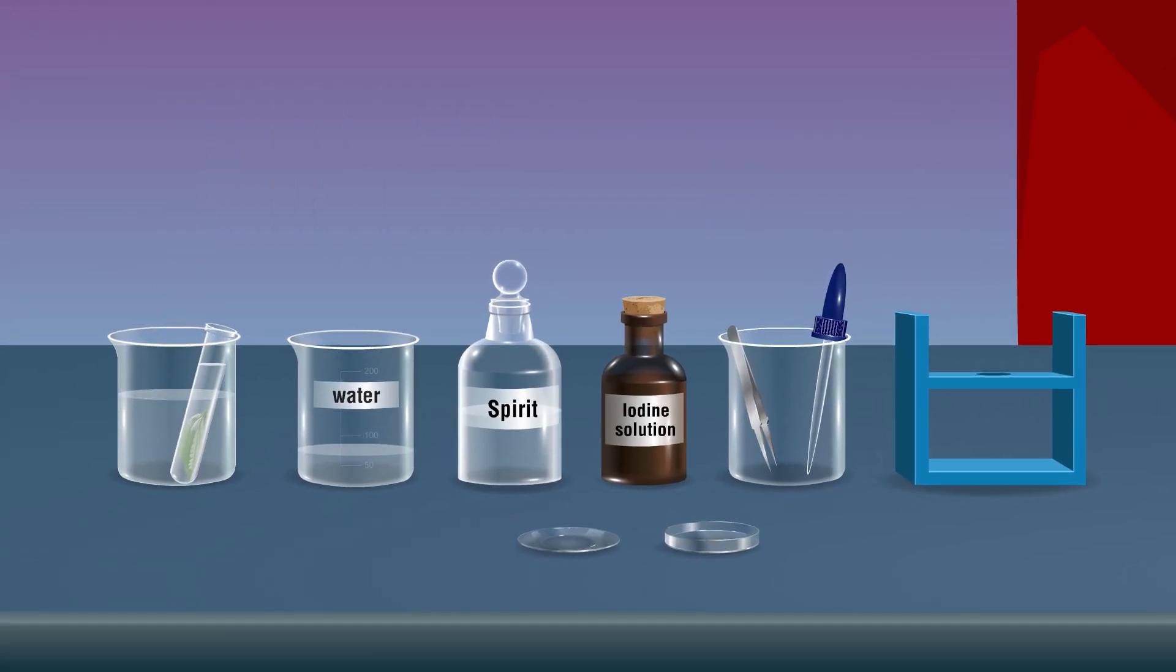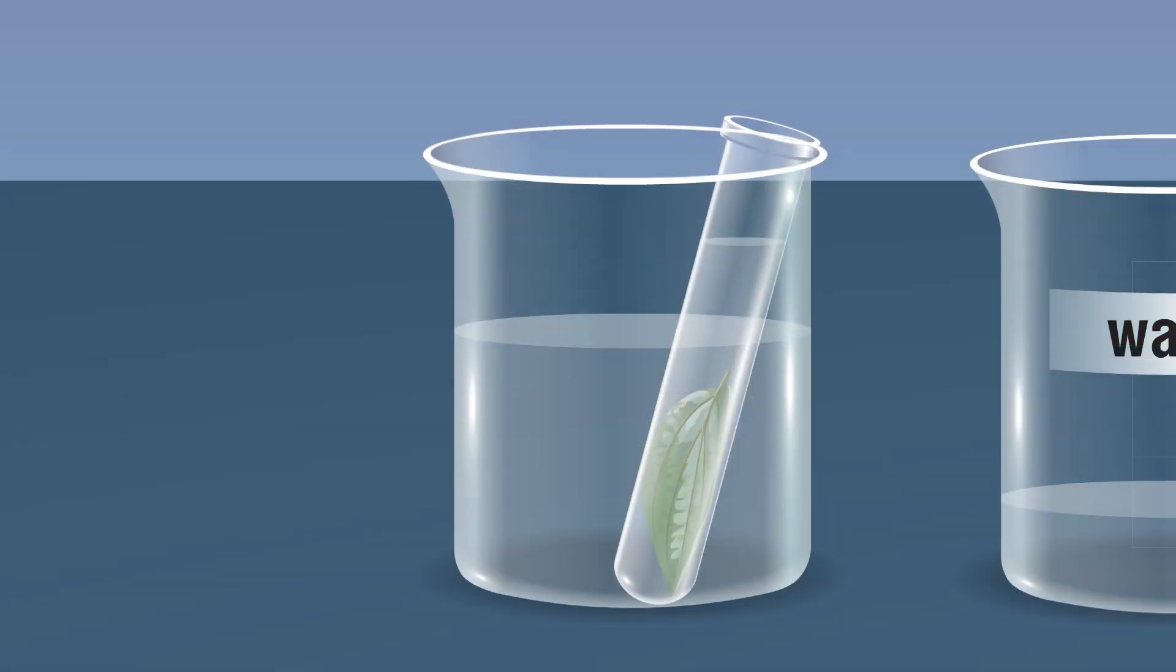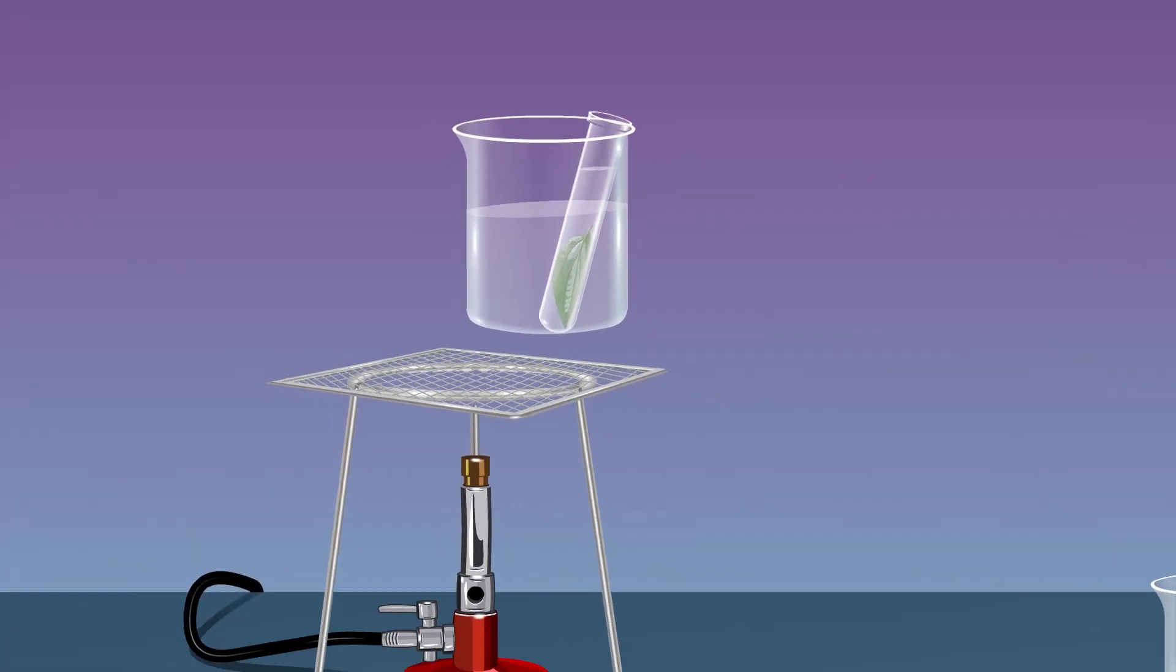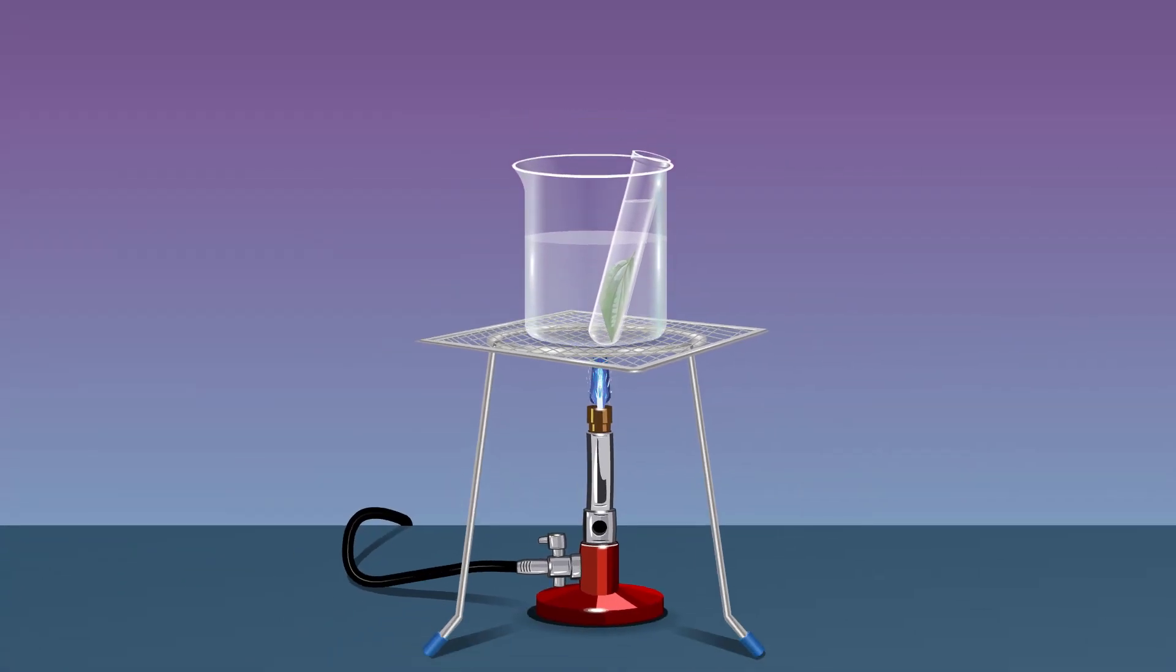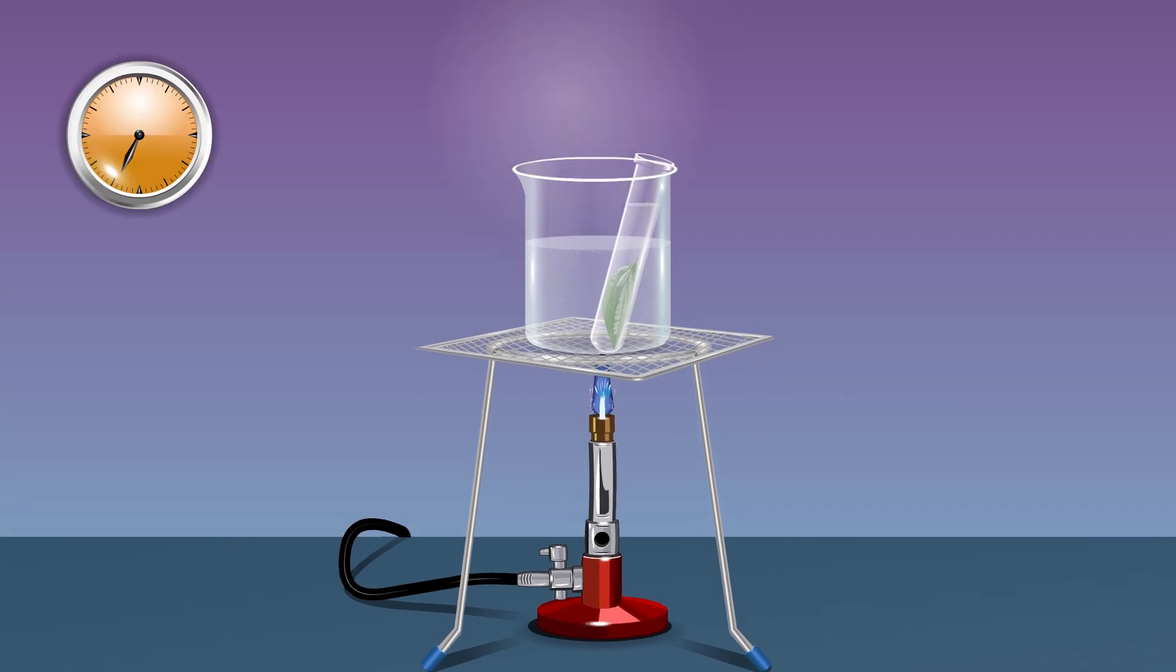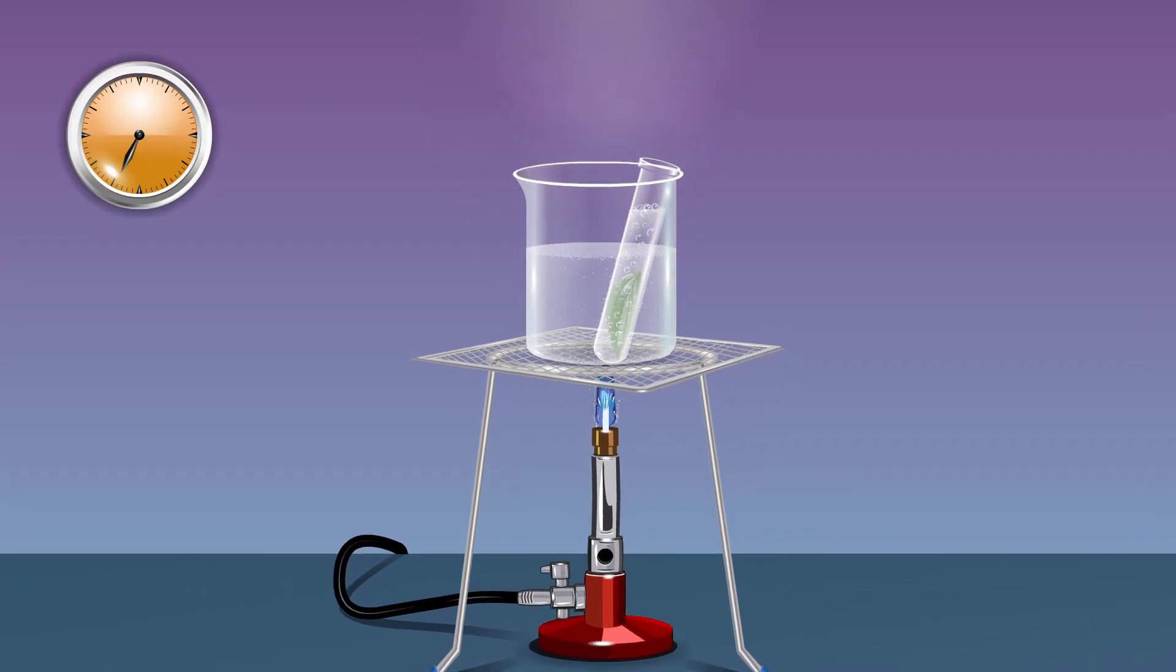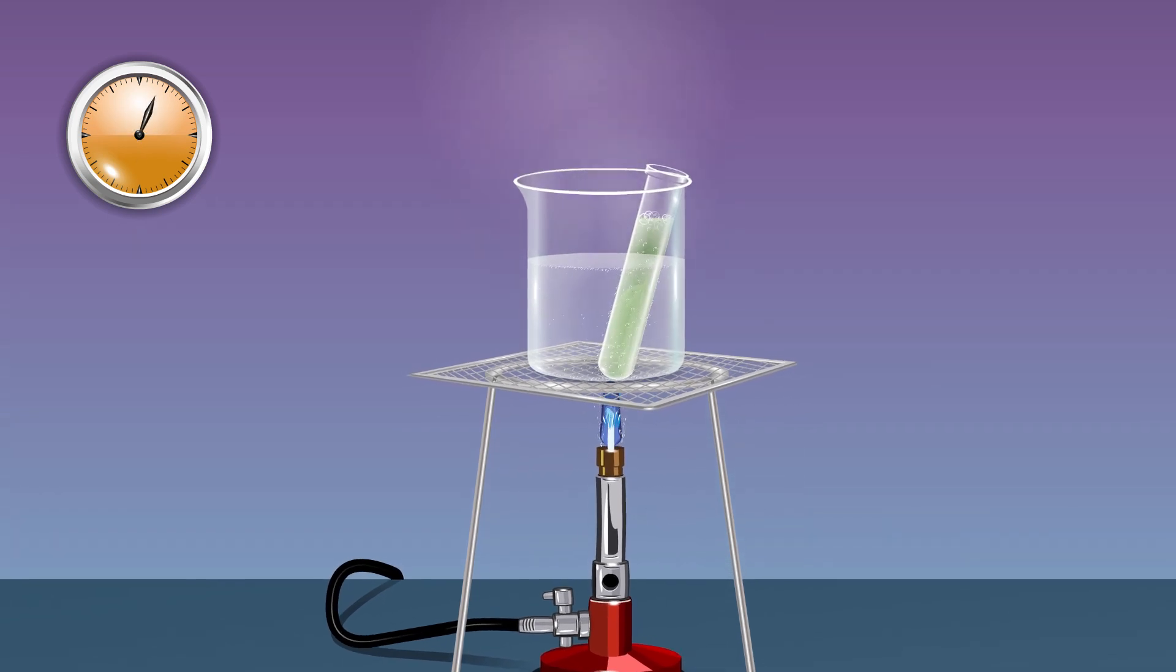Keep the test tube in a beaker half filled with water. Place the beaker on a tripod stand. Boil the water until the spirit becomes green and the leaf becomes colourless.